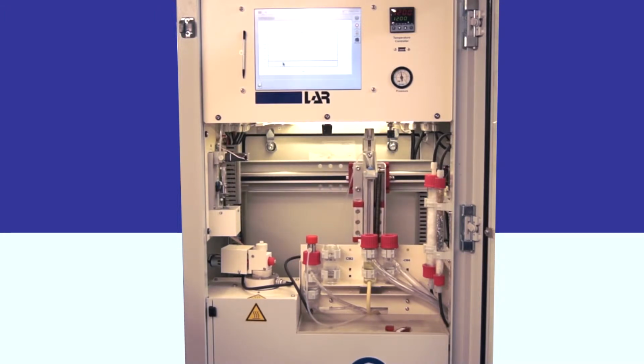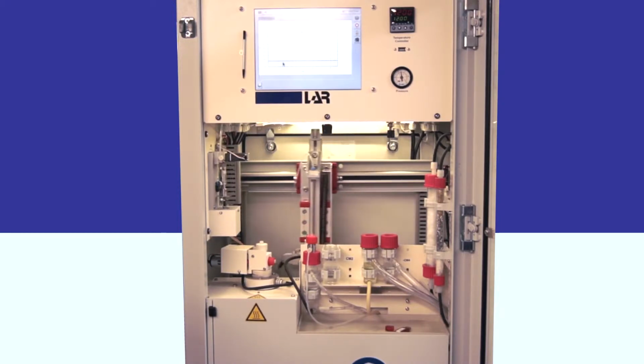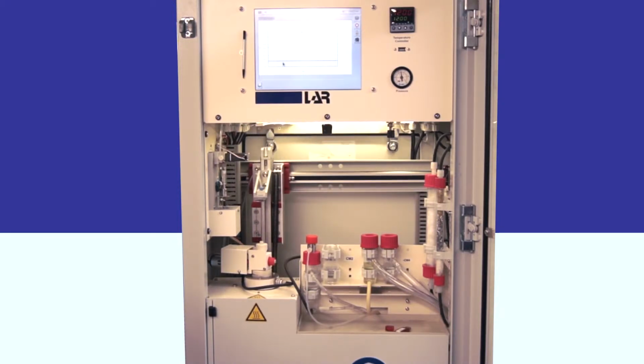The XY arm positions a needle over the sample vessel. The needle is lowered into the sample vessel and a sample volume is drawn. The XY arm carries the sample to the furnace and the needle is lowered into the furnace valve. The sample is injected, the needle retracts, and the valve is closed.